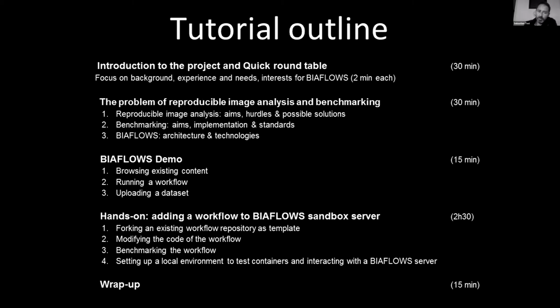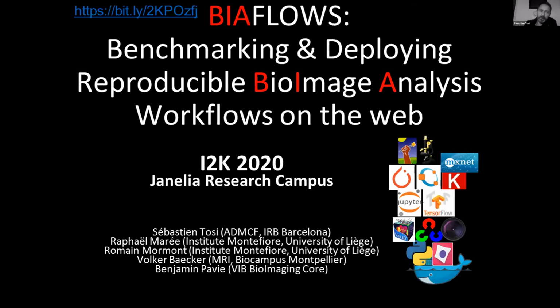But again, I insist, please interrupt me or ask any question if something is unclear. For the hands-on especially, I think it's quite convenient that you have the slides from my presentation on your machine, because then you can copy-paste some links or commands that we're going to use. So here on the first slide, you see on the upper left, you have a short link. So please copy this link, open it. It's a Google Drive folder where you will see the presentation I'm showing now in PowerPoint and PDF. So you can access the slides and use them.